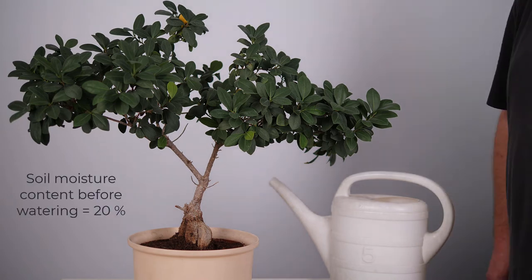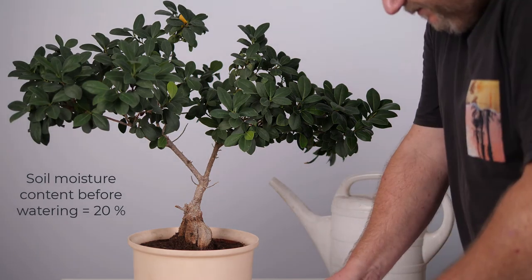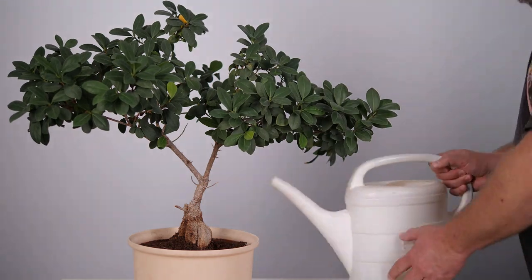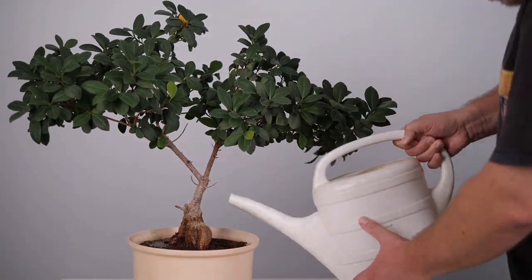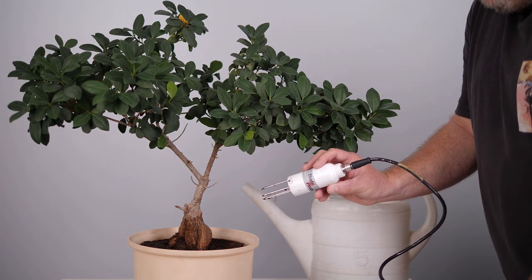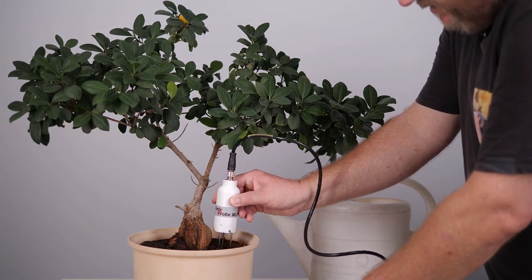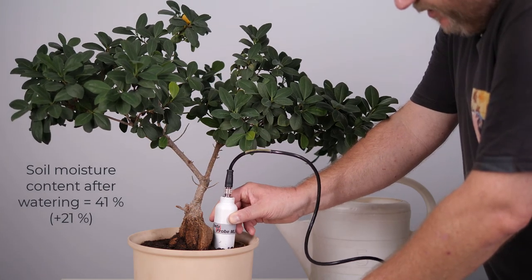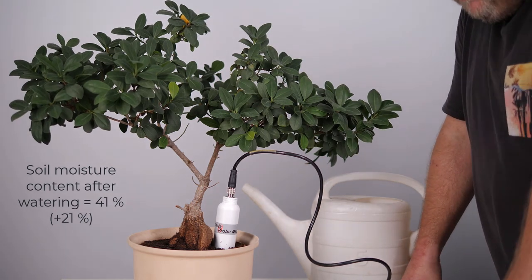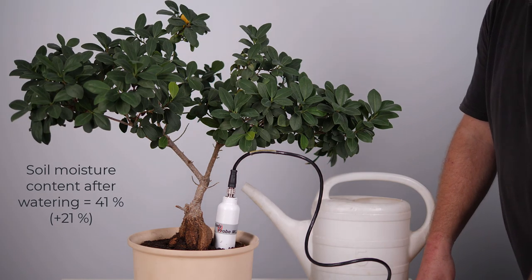If we are lucky, the TDR measurement device will show us an increase in soil moisture. We added some water to this flower pot and now I will take a second measurement using this TDR device. I insert the sensor unit with the waveguides into the soil, press the read button, and now we have 41.2% volumetric soil moisture after adding water.